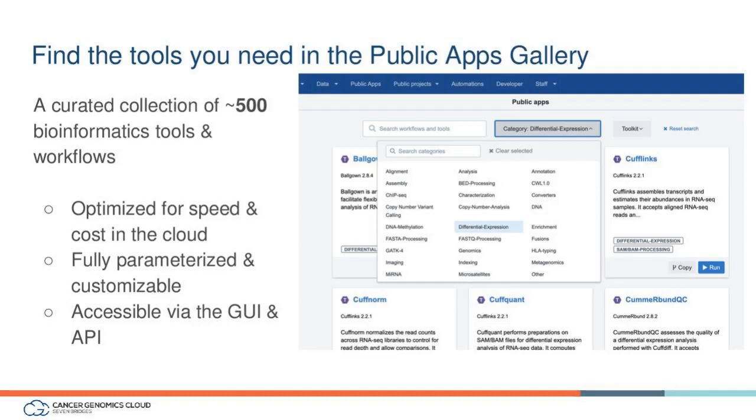In addition, you have a benchmarking section, which is generally a table that'll give you an idea for how much time and also how much funding it'll cost to run this tool for a variety of different either file sizes or sample sizes. So that's very, very helpful.